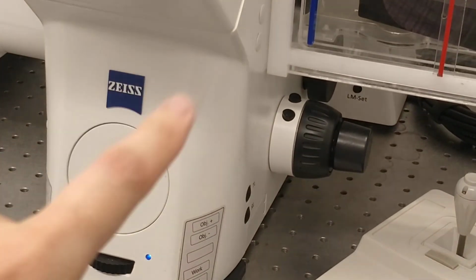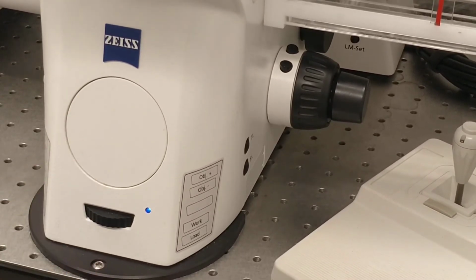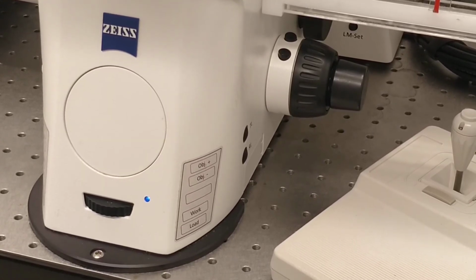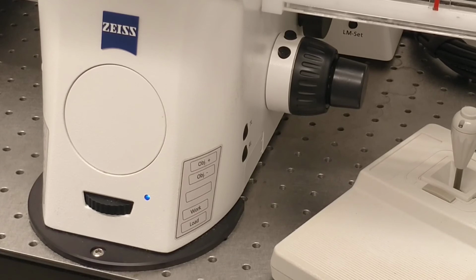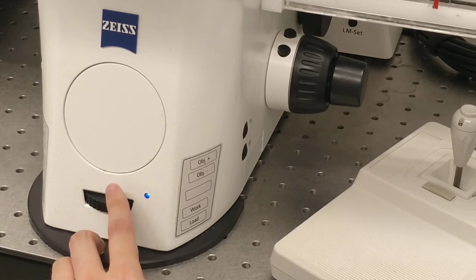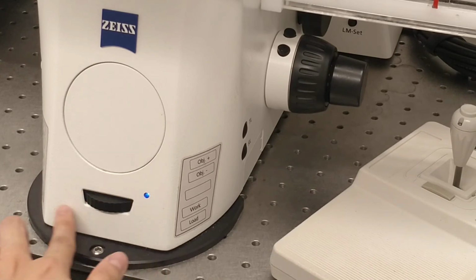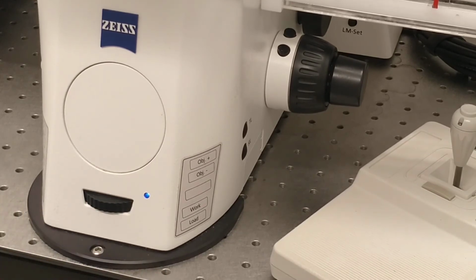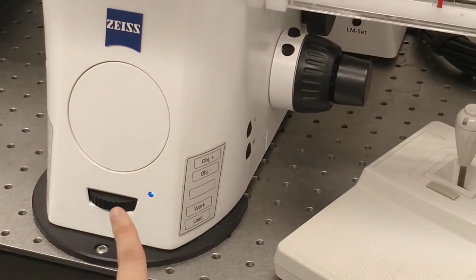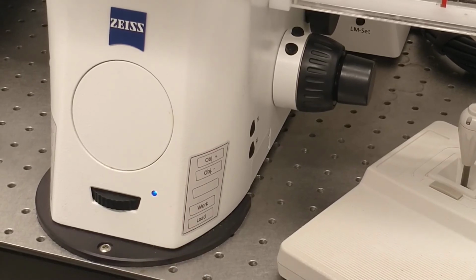So this wheel, you can increase or decrease the bright field, because there is actually something up there that opens or closes the light source to allow more light in or less light in. So you can decrease it here, and this is actually connected to the software. So if I decrease it here, on the software it's going to go lower as well. So they are all interconnected. However, this does not work for fluorescence. So for fluorescence, you will most likely need to use the software to increase or decrease the light intensity.